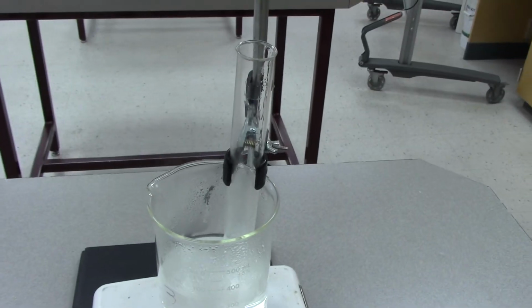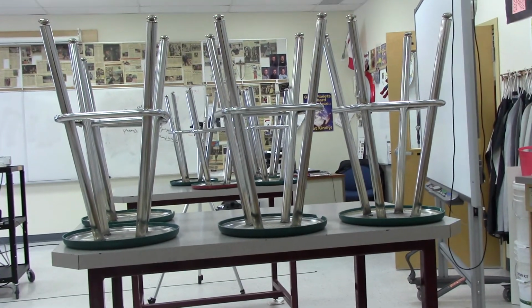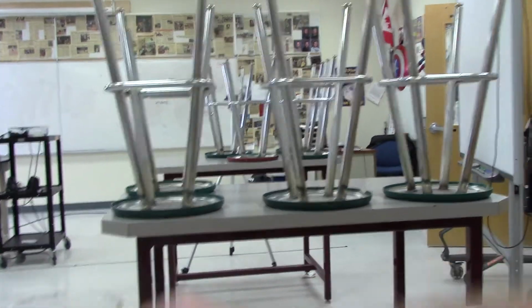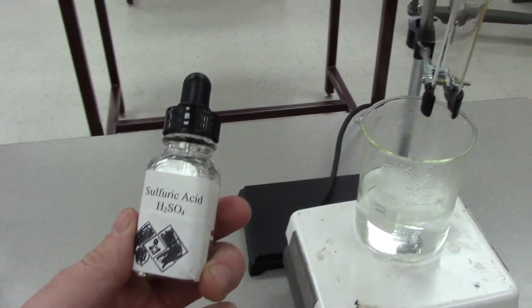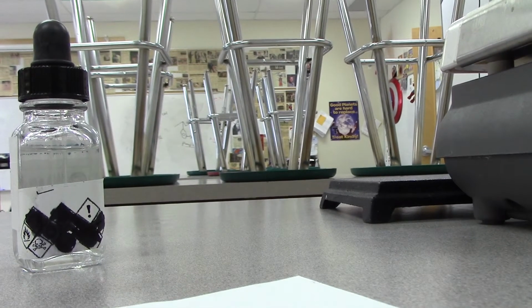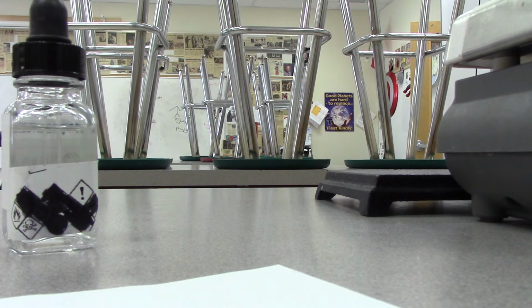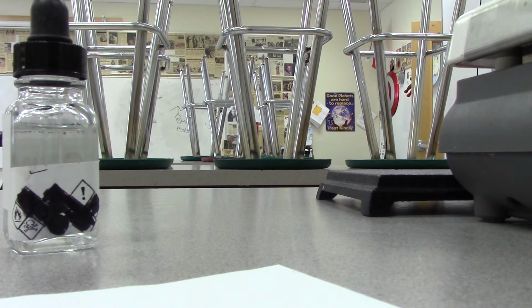Now I need my acid catalyst. This is 18 molar sulfuric acid. This is very, very concentrated. So I'm going to add my acid catalyst in here. Ten drops.